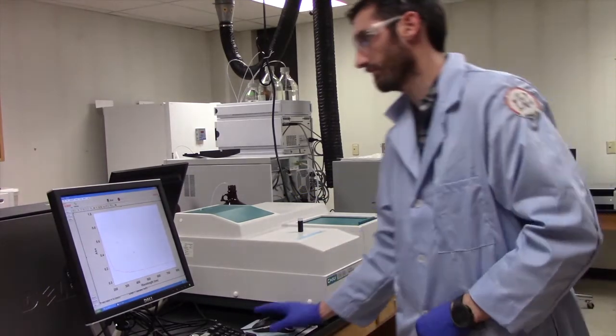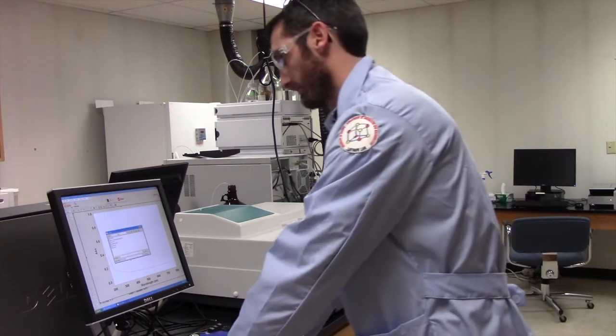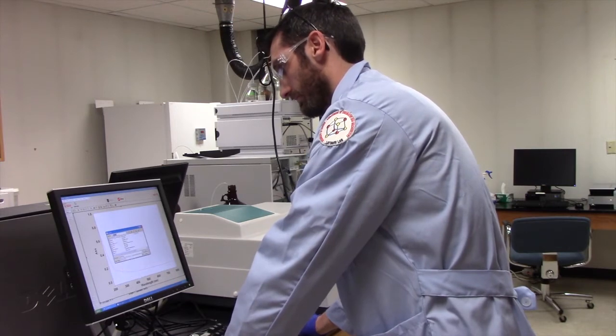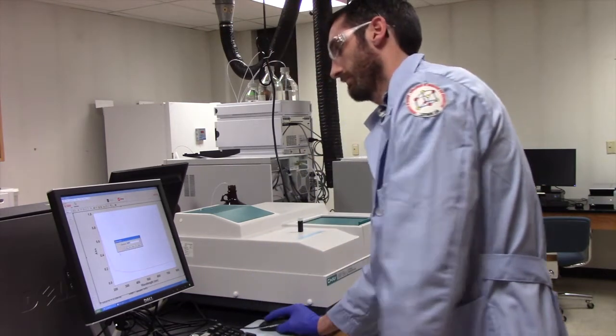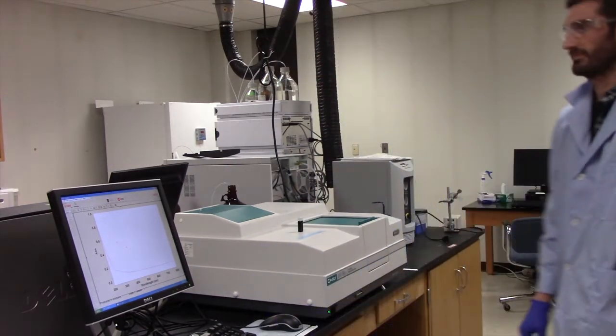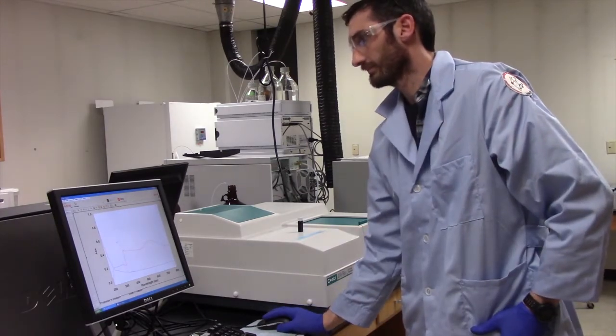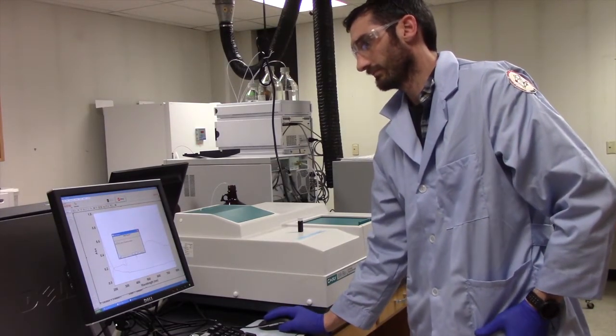Switch the cuvette with your protein solution and run the same scan from 800 nanometers to 200 nanometers. Export the data. When finished, close out the program and turn off the spectrophotometer.